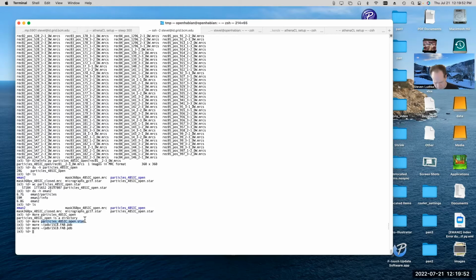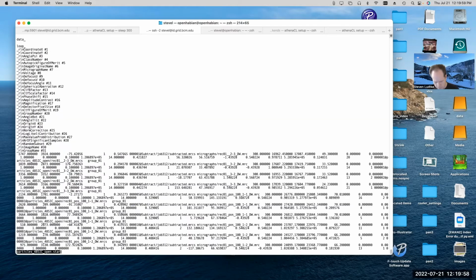If we look at one of these star files, they have certain similarities to the file we were just looking at. Basically, a star file is designed to store spreadsheet data, more or less. It's designed to store a block of data where you have rows and columns, and every row and every column has to be populated with values. But the individual rows and columns have arbitrary width and more or less arbitrary contents.